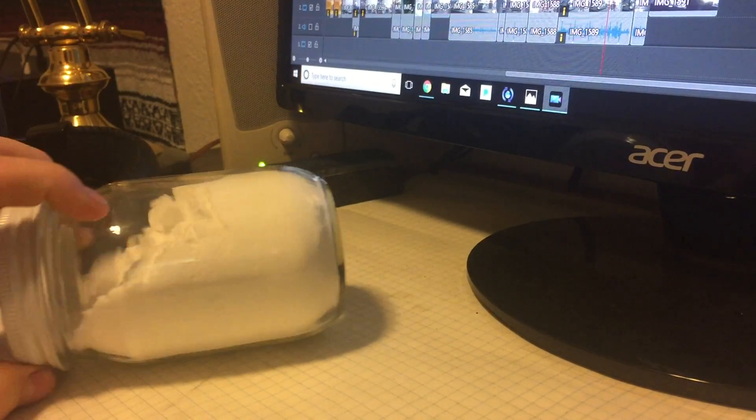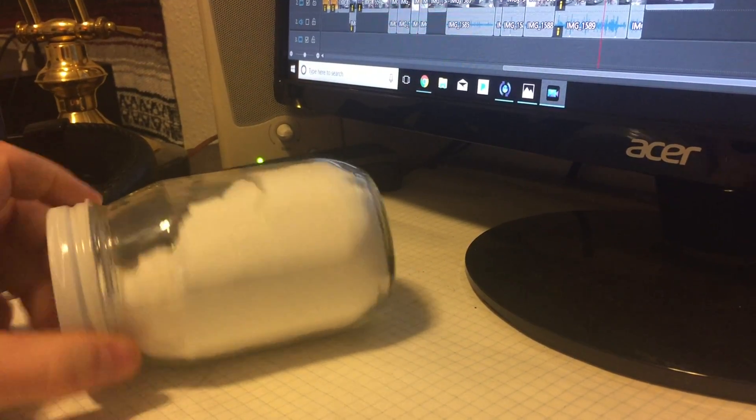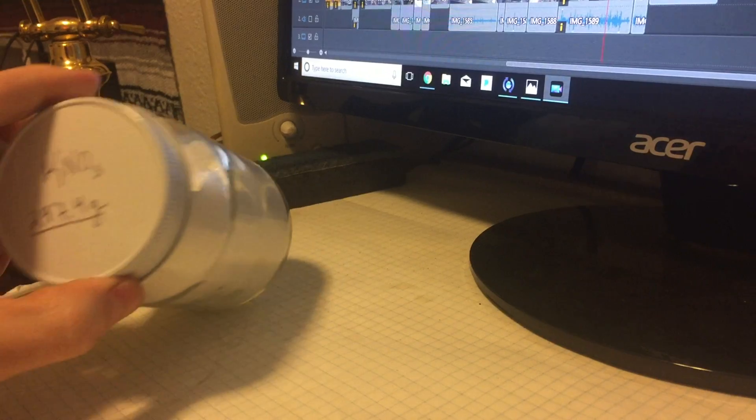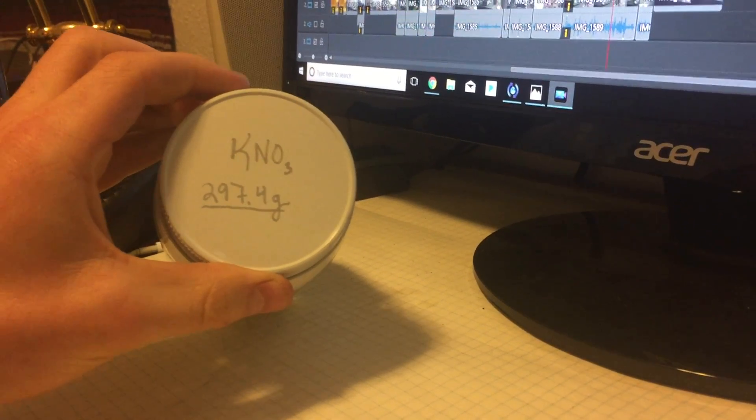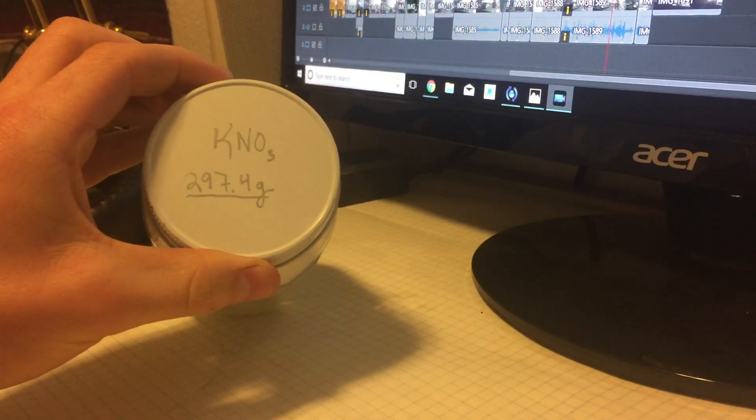When I boiled the solution down, I intended to boil it down a full liter, but I ended up only doing 500 milliliters, and this also contributed. In the end, though, we were able to produce a pretty substantial amount of potassium nitrate.